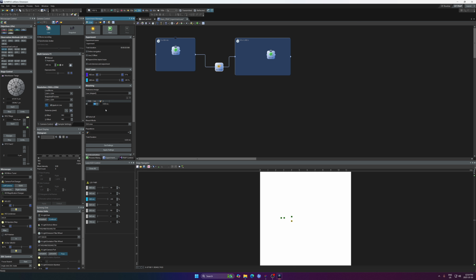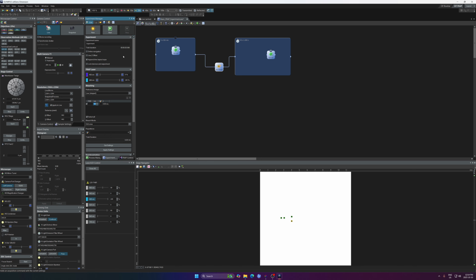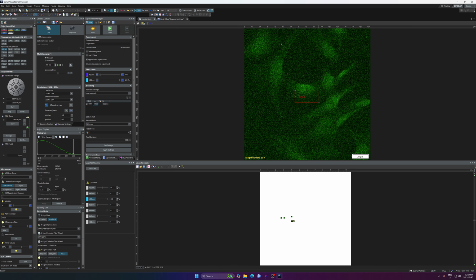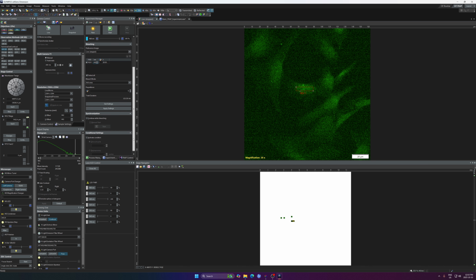And because we don't have 0 milliseconds, we haven't drawn an area yet, so we have to go back to the reference image, which is live. Stopped, which is this one. Oh, so we have a region of interest. We can adjust this, or just zap that area. And then you have a region of interest. When I stop, this should have a time. And I will do 6, so be it, it's 6.